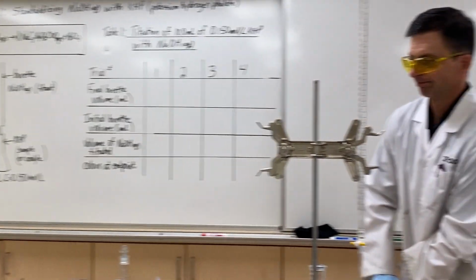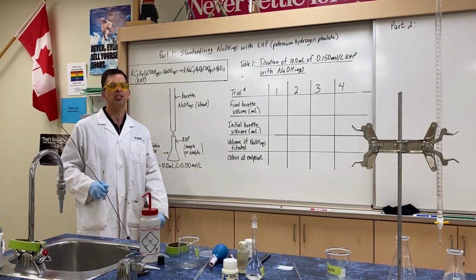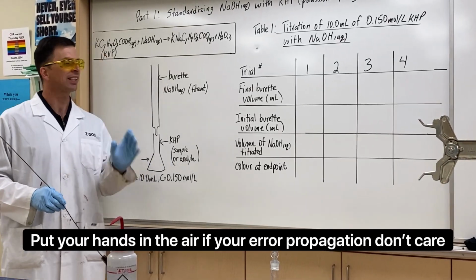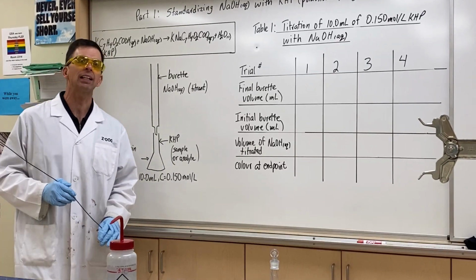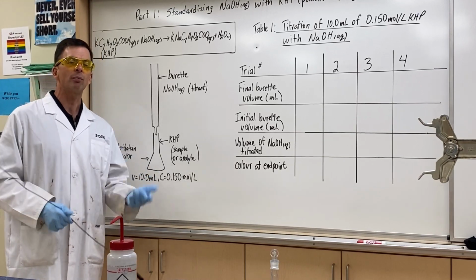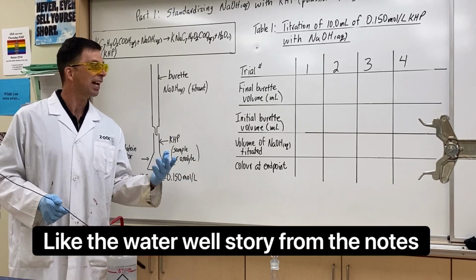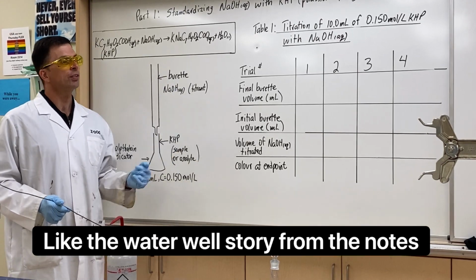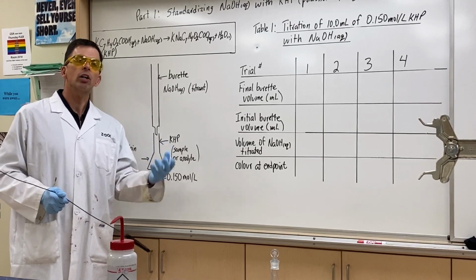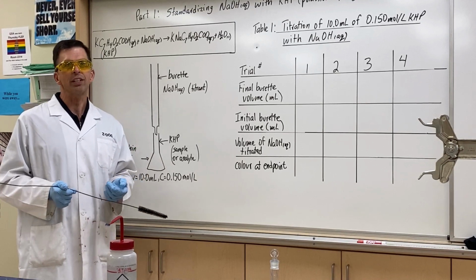Okay. Hey, we're back. Titration, analytical chemistry. Love it. My favorite part of Chemistry 20. Titrations are really important analytical chemistry skill. Can be used from anything from environmental testing, water samples, forensic samples. Our goal today is eventually to determine the amount concentration of some white vinegar to test the manufacturer's claim.